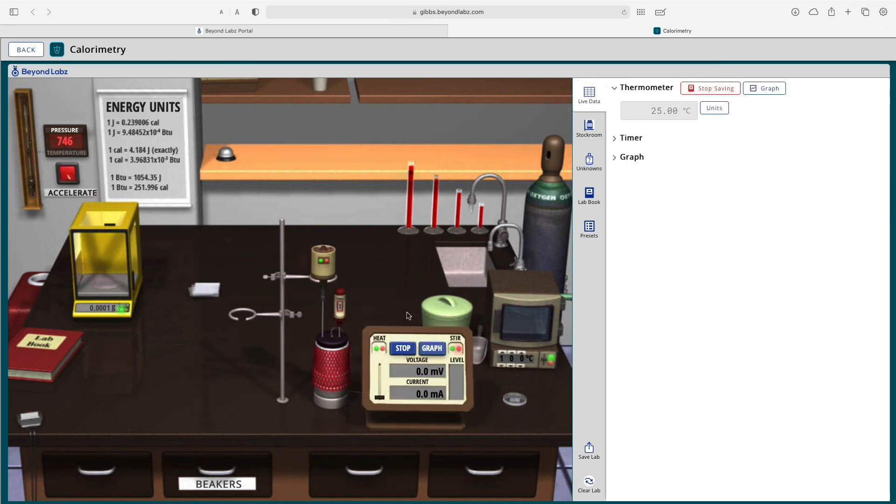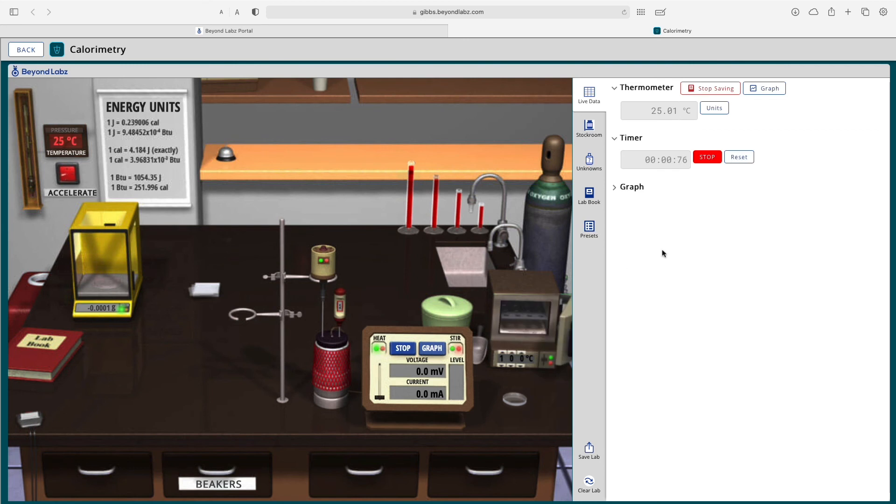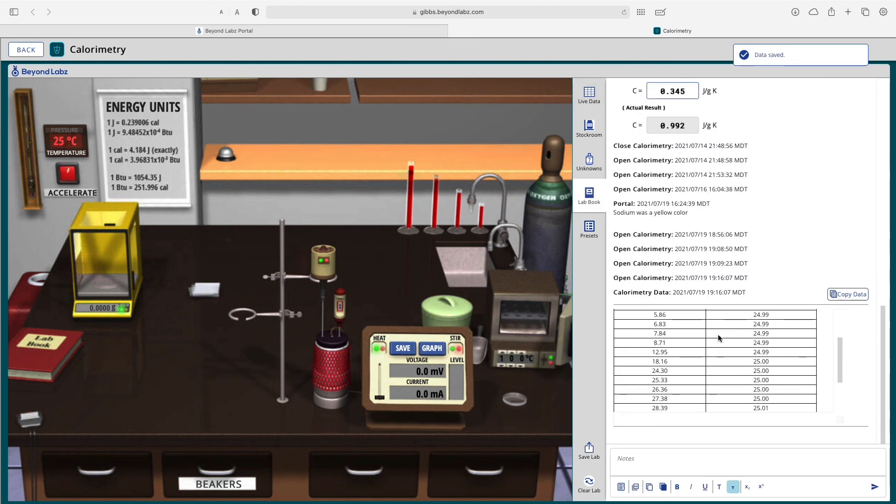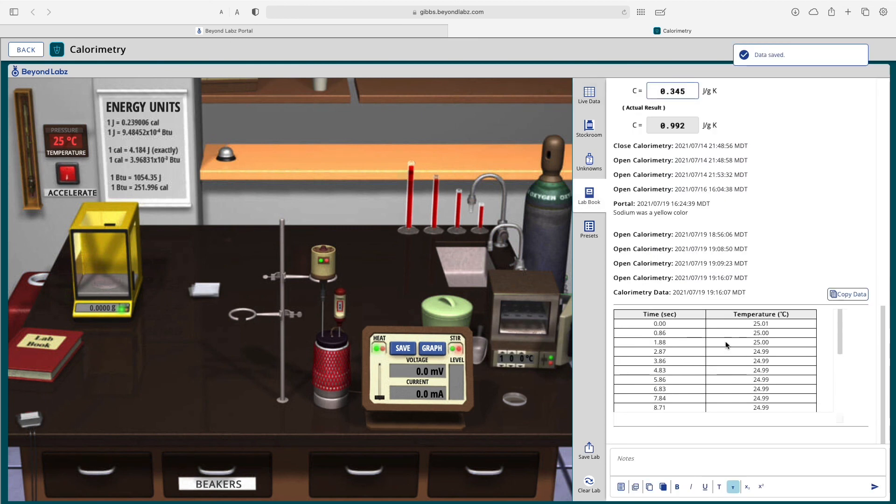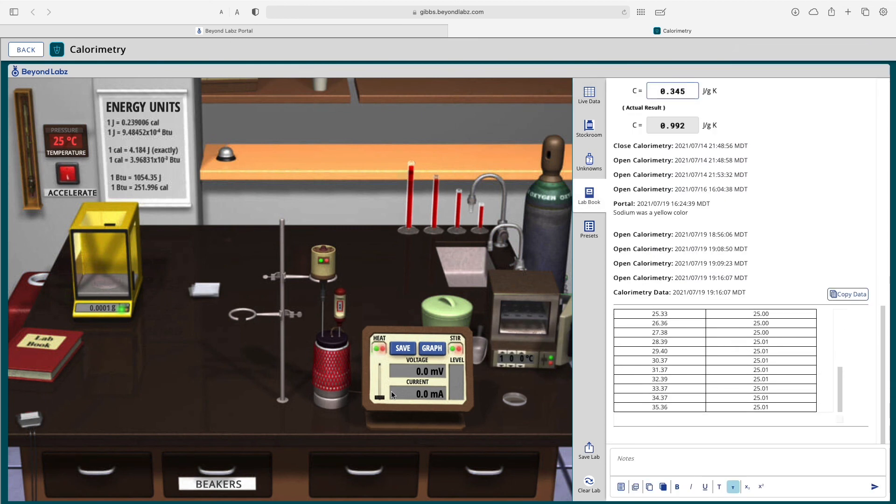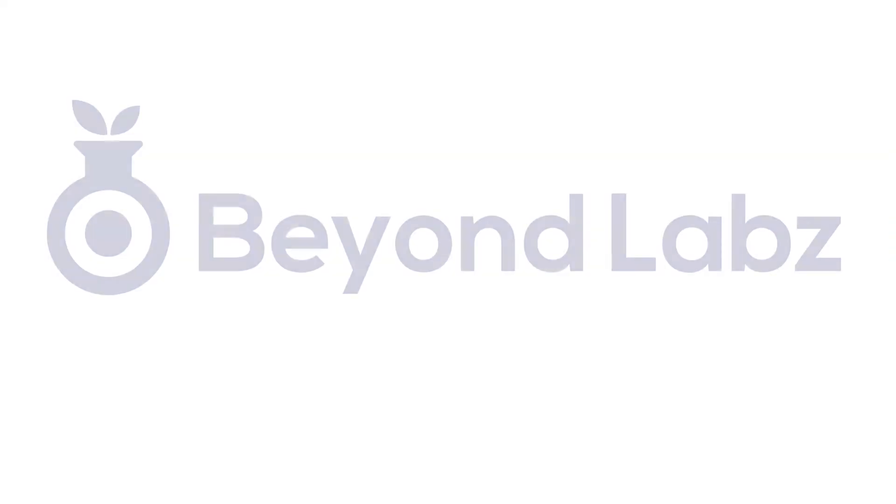We can even heat the calorimeter, stir it, stop the timer, stop saving data, and then any data we've saved is being added to our lab notebook. Just trying to show you the different things you can do in the calorimetry lab.